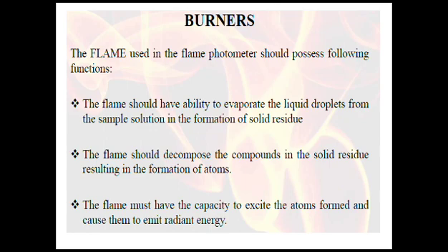So the flame is used as an evaporating source also. It is also used as an excitation source, and it excites the atoms to a higher energy level, and then when they come back to their ground state, they emit the radiant energy.